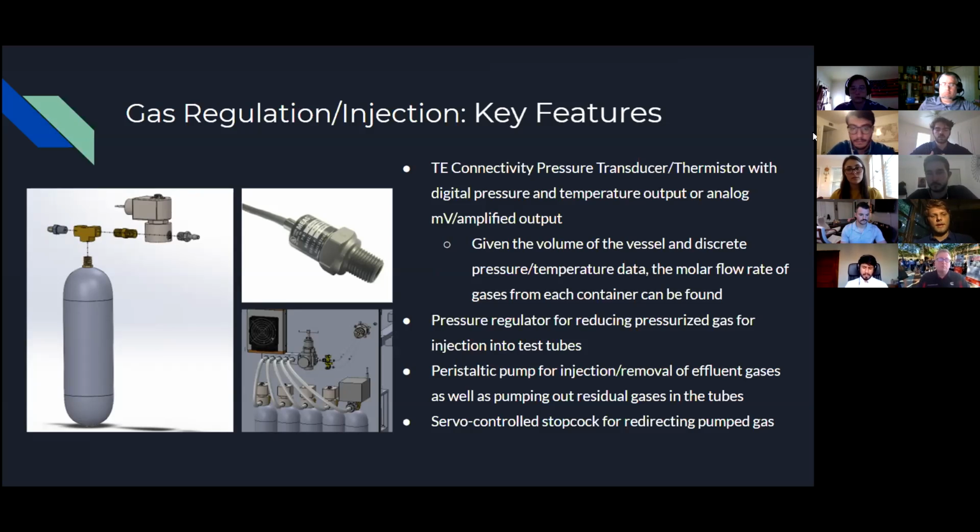And so using this data, the motorized ball valve for oxygen gas and the solenoid valves used for the other gases can be programmed to dispense a quantity of gas based on the atmospheric parameters given by the user. Like the liquid handling subsystem, this design uses a peristaltic pump, which can be used for gases at low pressure. Once the gas from the tanks reaches the manifold, a pressure regulator will reduce pressure to then be pumped into each rubber capped test tube through the injection needle.